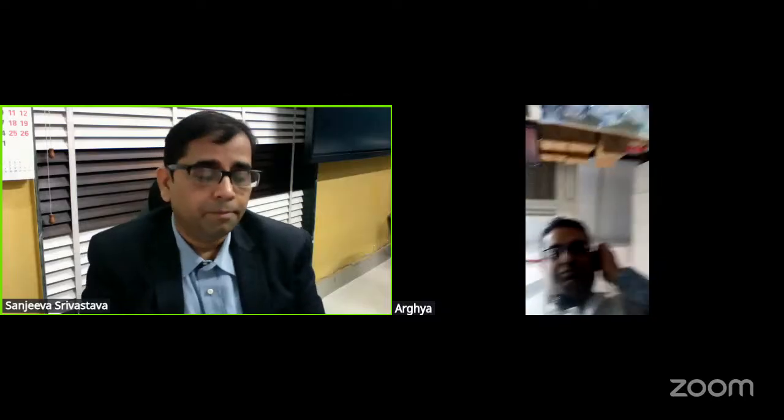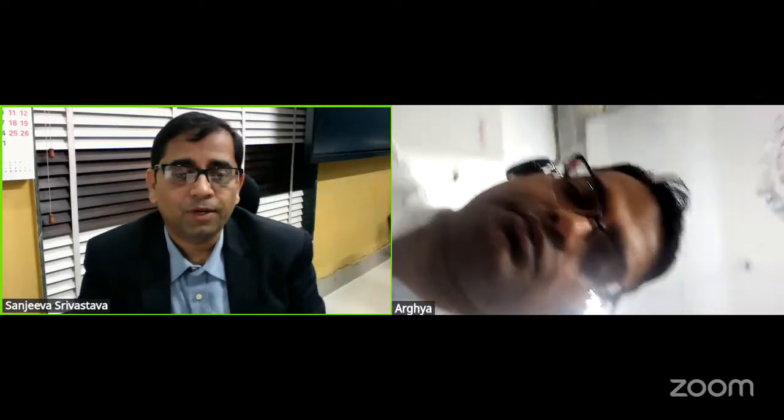All right, so after some overview, now I think the main agenda is to give you the actual demonstration in the lab. And the TA and the team of the Proteomics lab are going to give you more of a cooking show, showing some of the key steps involved, from sample processing to moving to the gel.